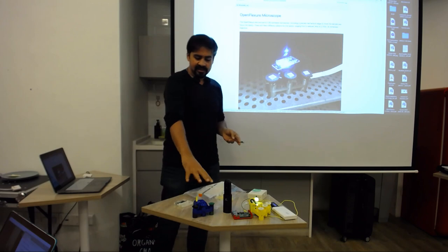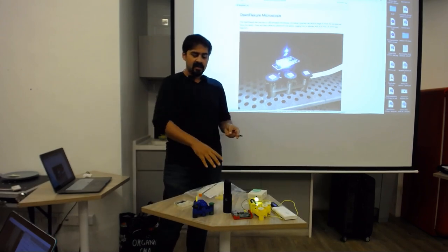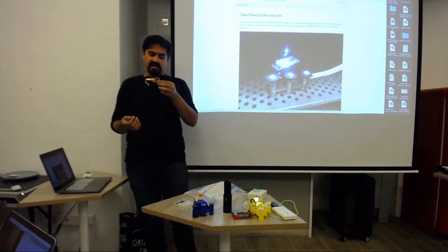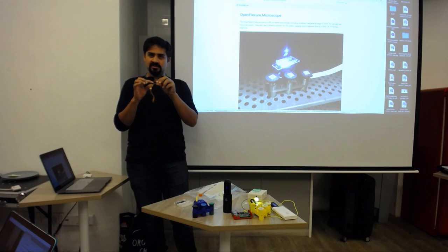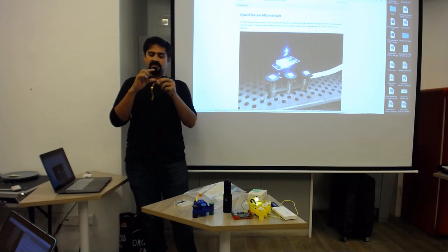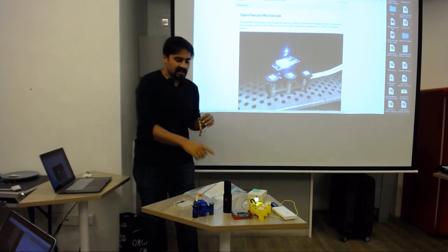Second clever bit. Okay, first clever bit is that it's 3D printed. Second clever bit is that it uses a Raspberry Pi. The third clever bit is that it reuses the Pi camera and the Pi camera lens. So it doesn't use a special lens, it reuses the same lens. So what you do is you disconnect the lens and increase the distance between the sensor and the lens. What that allows you to do is focus on things that are very close. So it reduces the focal length, and so that's what you have underneath.